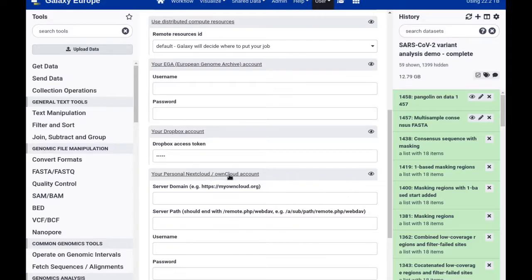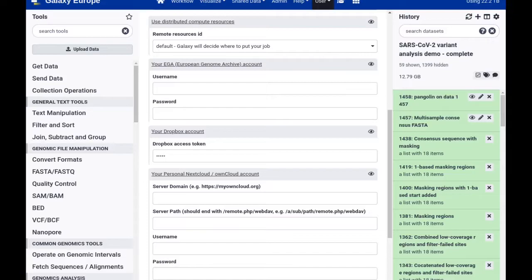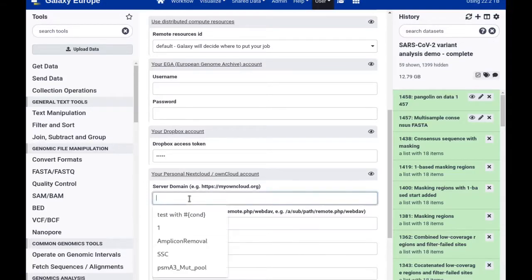Of course you will have to provide credentials of some sort that Galaxy can use to authenticate itself against the other platform. In my case, my department at the University of Freiburg operates their own Nextcloud server on which every member of the department gets an account. So I'm going to use this in this demo.